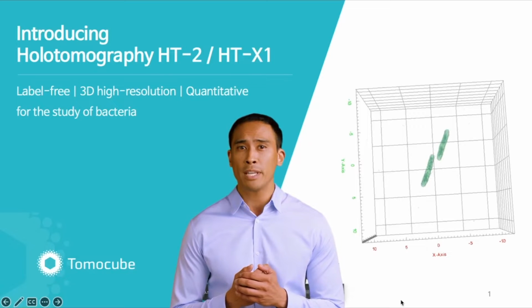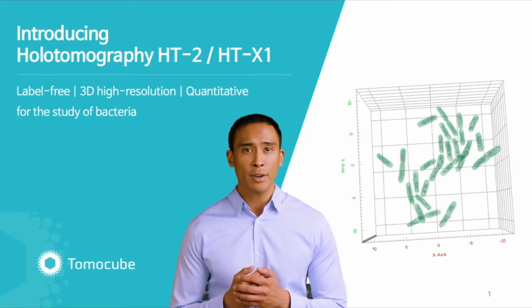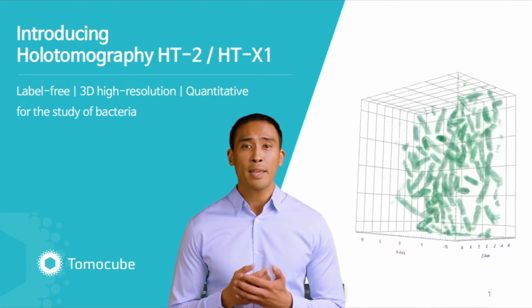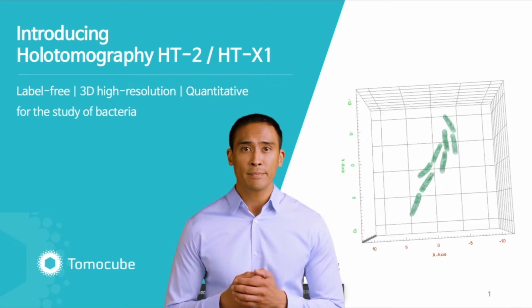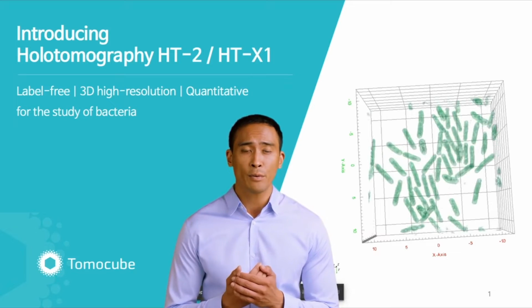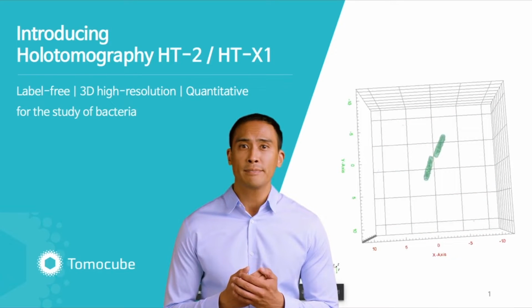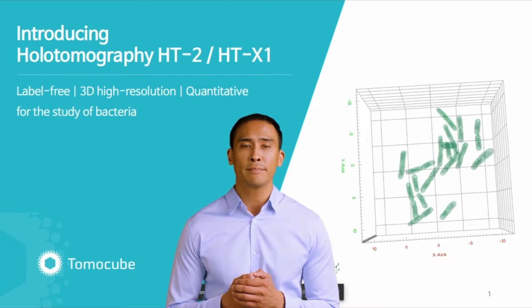Hi, we are Tomocube, and we believe imaging and analyzing cells in their native states are crucial. So, Tomocube develops and presents Holotomography HT2 and HTX1, which enable label-free 3D quantitative imaging of cells. Without introducing any exogenous labeling agents, it allows us to visualize the subcellular structures of live cells with unprecedented details and for a long-term investigation.